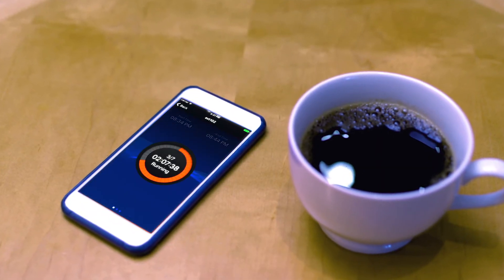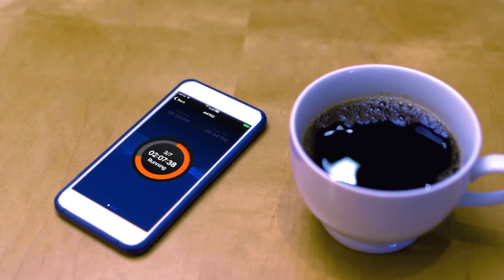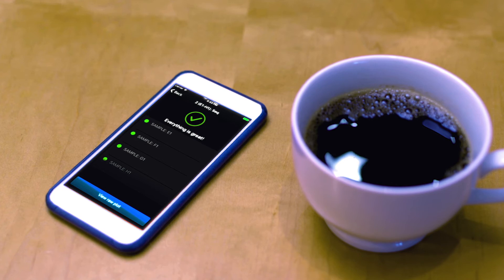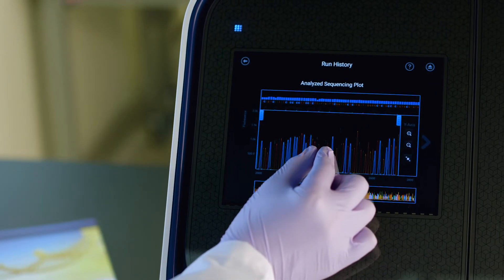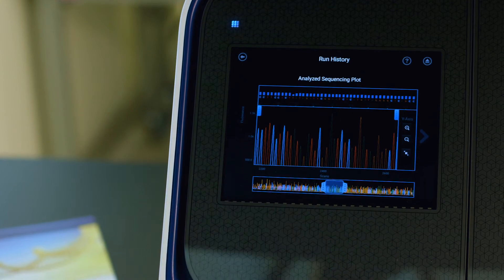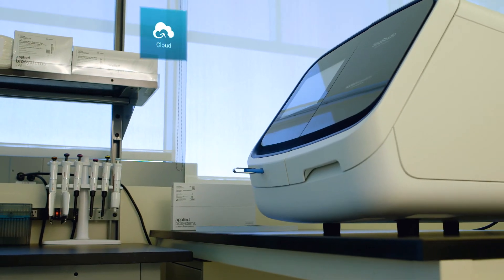Stay on top of your instrument's availability, monitor the progress of a run, and view Sanger sequencing or fragment analysis data in real time. Instantly see base calls and run quality right on the instrument.